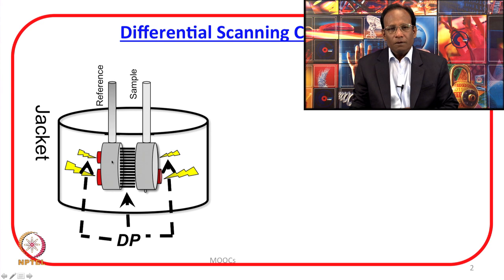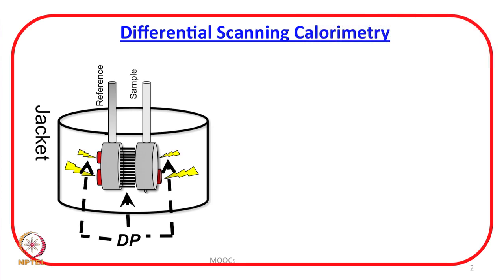Now, since proteins and nucleic acids are usually very expensive, one cannot afford to use a large amount. Therefore, different companies are making efforts to come up with calorimeters with very small cell volumes, requiring only a few microliters.